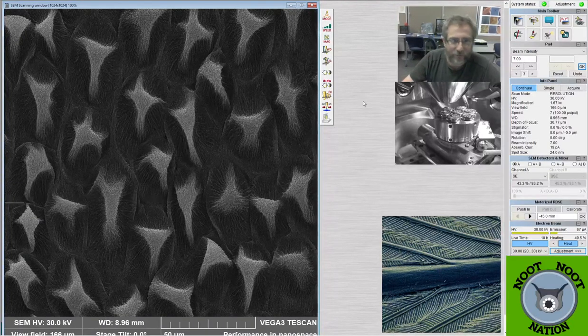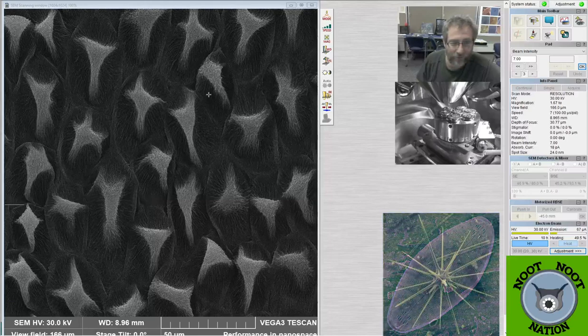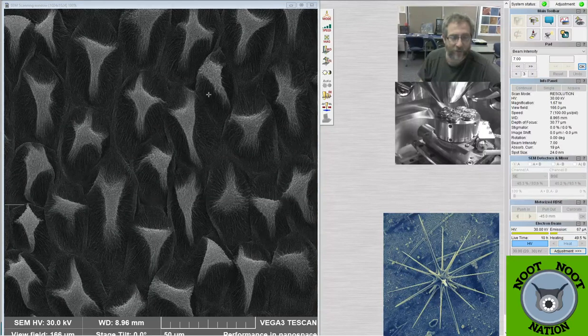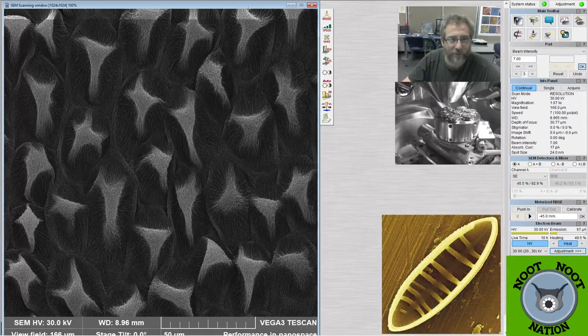So I'm even gonna take a crazy picture like this, but I wanna get the auto brightness fixed, because when you move from one stub to the next, it changes the amount of information that's coming. So I'm just gonna make it a little bit brighter, or I think it's gonna get a little bit brighter. It'll do it automatically. It's one of the things the SEM is pretty good at doing automatically. Focus I have to do, stigmation and all the other things I have to do, but getting the brightness right, it usually is pretty good at. So I usually just let it do it, because it's a lot of work to do it otherwise, than just turning knobs before I figure it out. See, and there, did a great job again. You can see how much brighter it is, and the detail between these two images to sort of give you some sense of the differences.